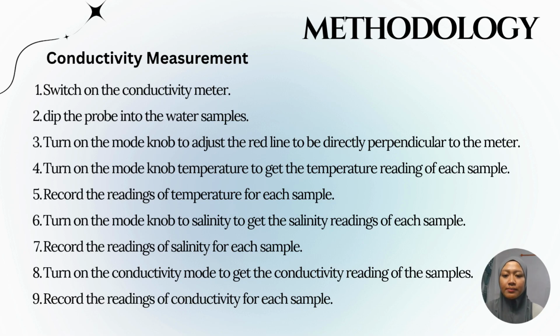Next, we turn the mode knob to salinity to get the salinity readings of each sample, and then record the readings of salinity for each sample. Lastly, turn the knob to conductivity mode to get the conductivity reading of the samples and record the readings of conductivity for each sample.